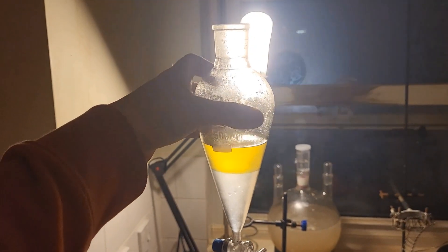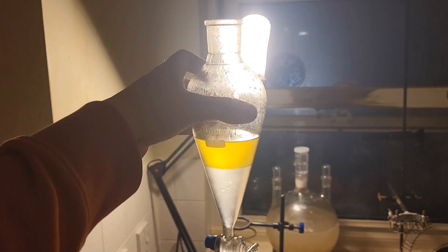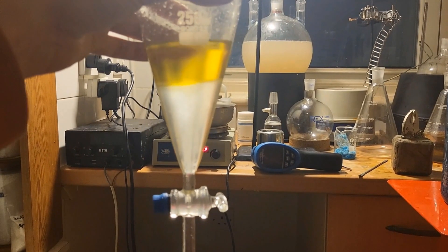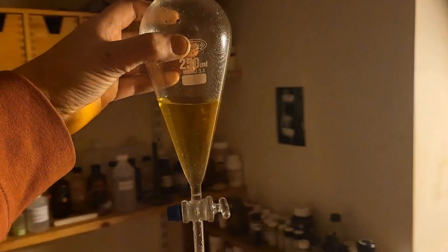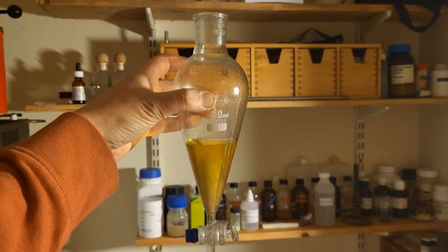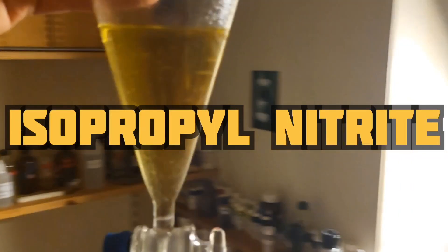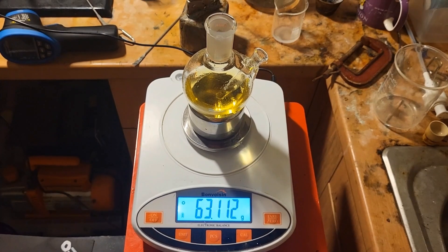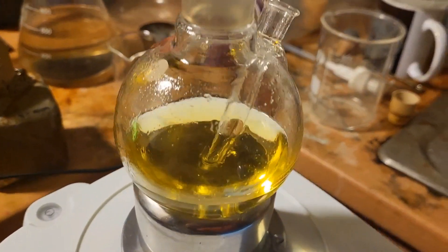Now I'm going to put the lid on, shake and vent very frequently. We can remove the lower layer. This here is our final product. We've made 63 grams of isopropyl nitrite.